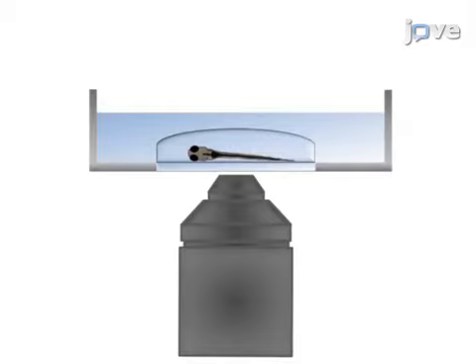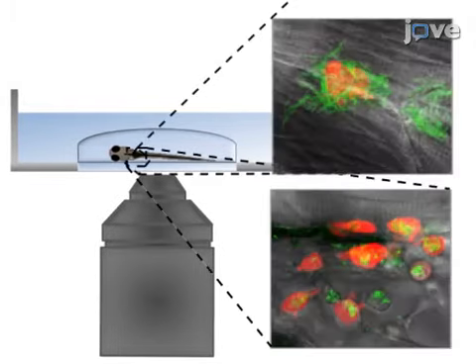of the infection. Ultimately, the results which can be obtained show the specific interactions between the fluorescent phagocytic cells and M. abscessus, either as individual bacilli or as serpentine cords inside a transparent embryo.